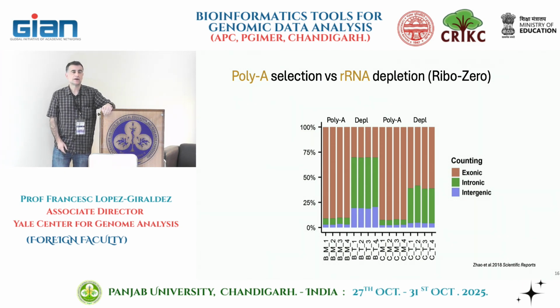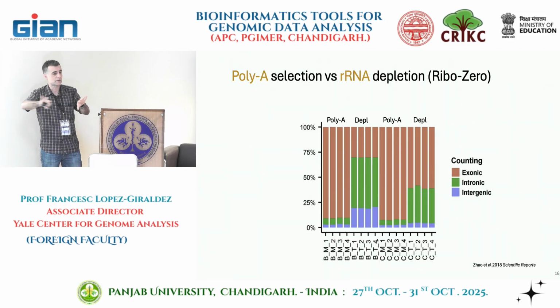If you remember in the slide, we're talking about the process. There's a size selection step. For protein coding genes, generally we pick every fragment that is 100 or above. But if you want to do small RNAs, you'd throw them away, because mature small RNAs are generally about 20 in size. So if you throw away everything shorter than 100, you're missing the small RNAs. In those cases, you can prepare a separate library with the shorter fragments and do a small RNA-seq.